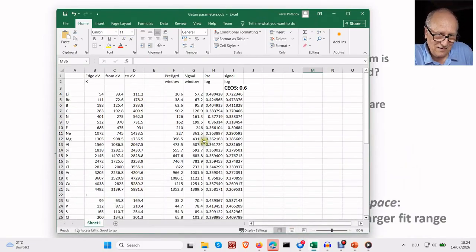But if we recalculate them in logarithmic scale, we find that they are more or less constant. They change from 0.35 to maybe 0.5, and that is nearly close to fixing the range in logarithmic scale.